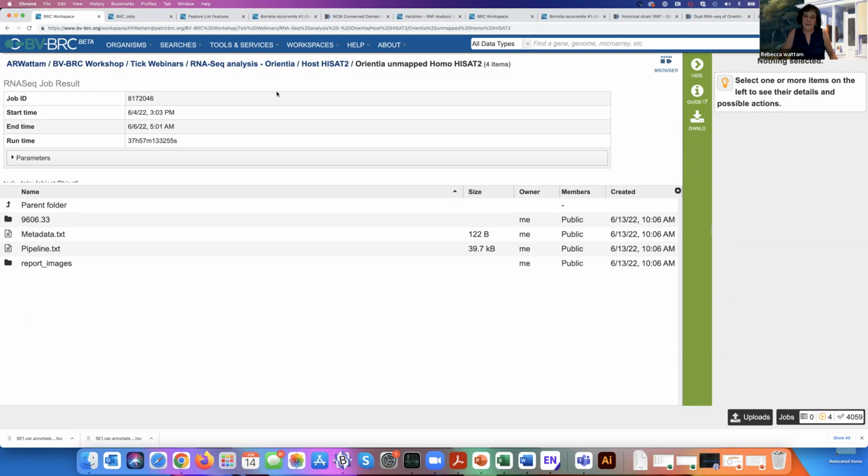if you have 1,000 things to compare in this, first of all, how are you going to compare it at the end? Maybe running machine learning on it to figure out how to analyze it. But in terms of how many replicates you need, I think the standard right now is you need 3 replicates to do it.